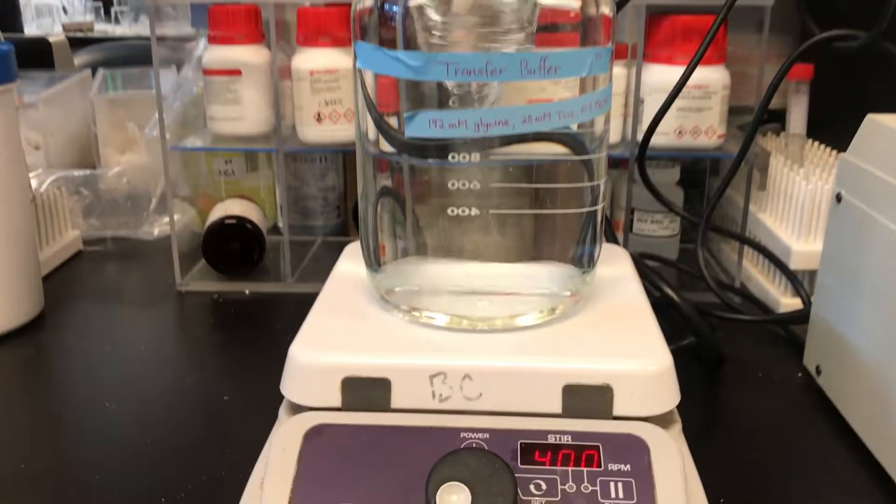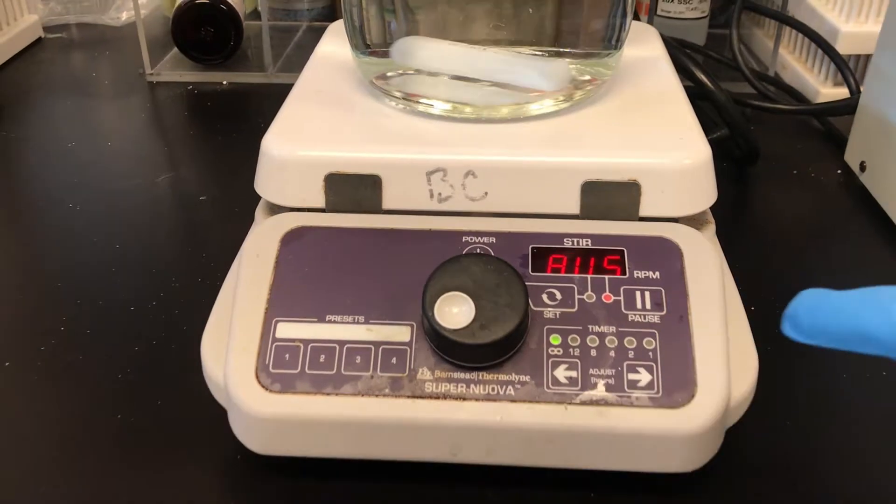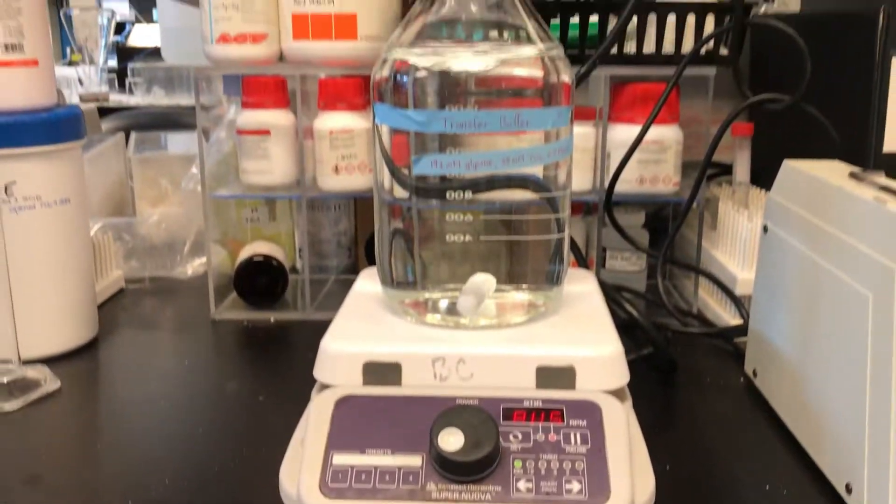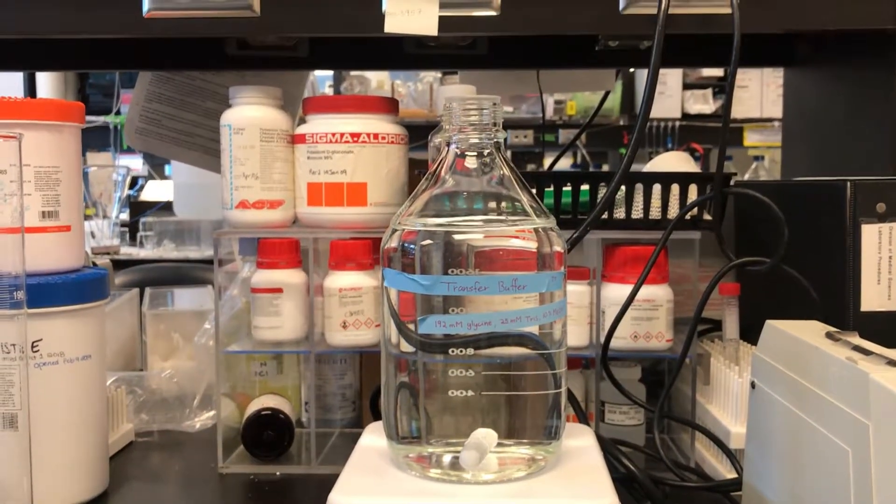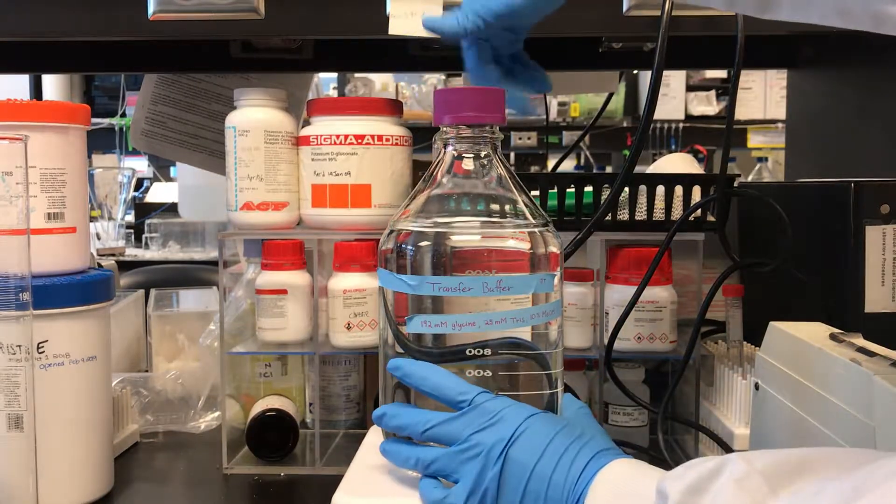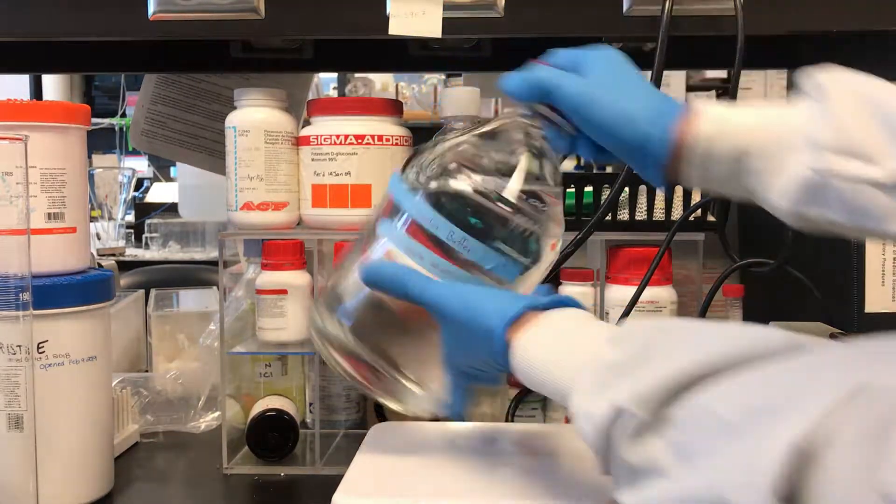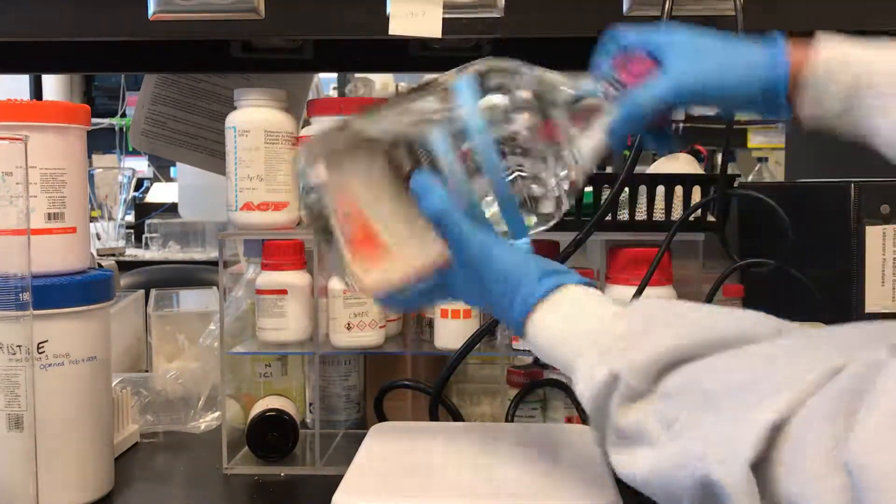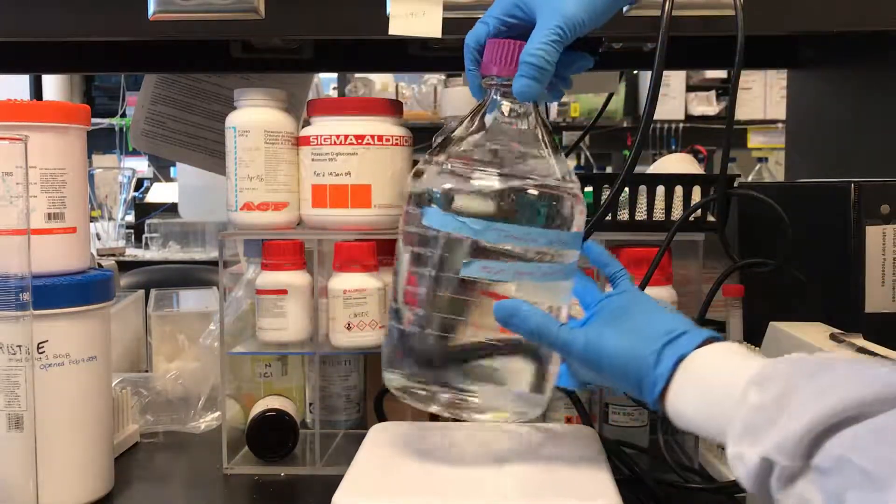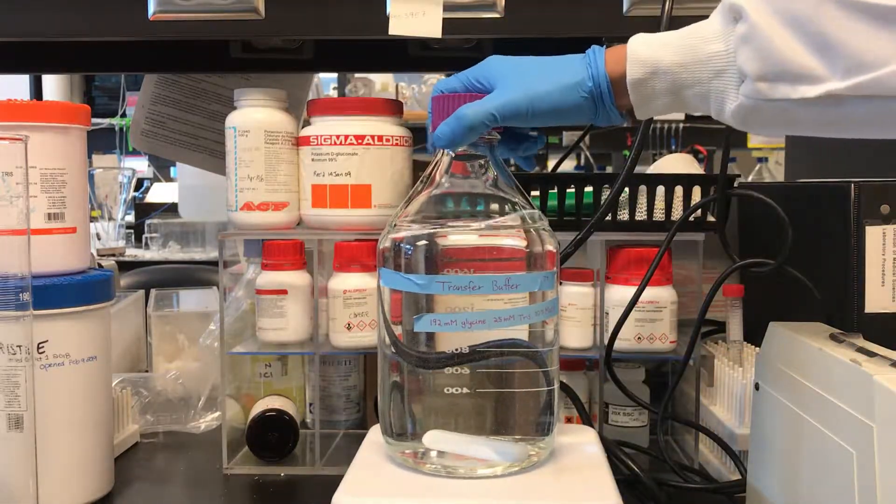Finally, stop the magnetic stirrer. Place the lid back on and tilt the bottle to flush chemicals at the neck of the bottle.